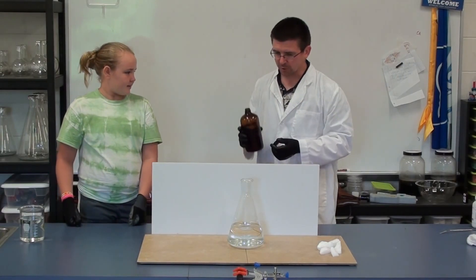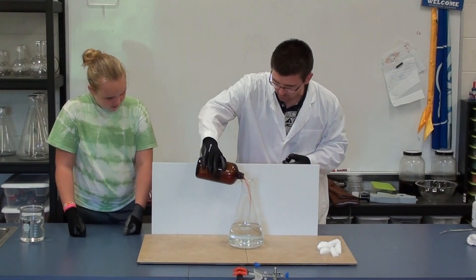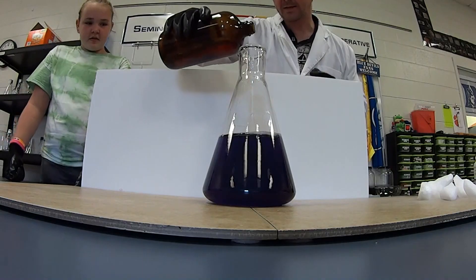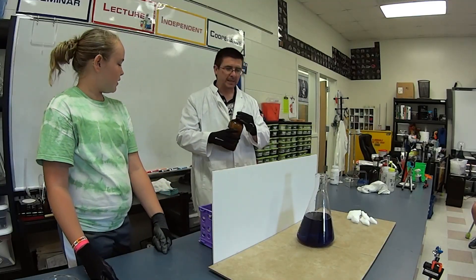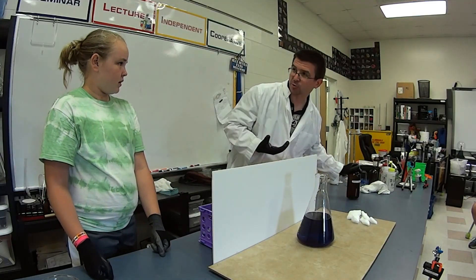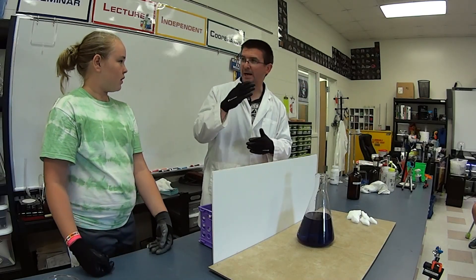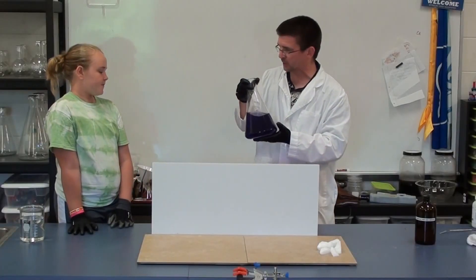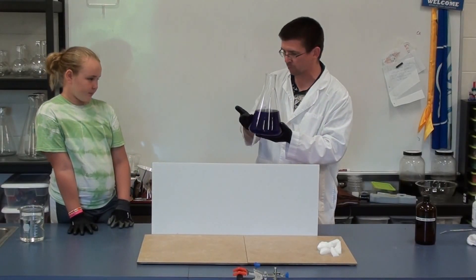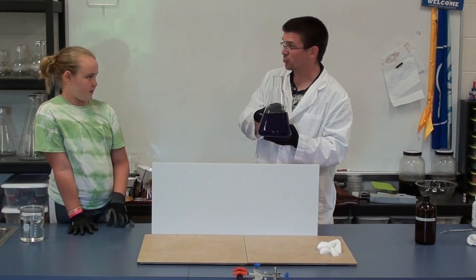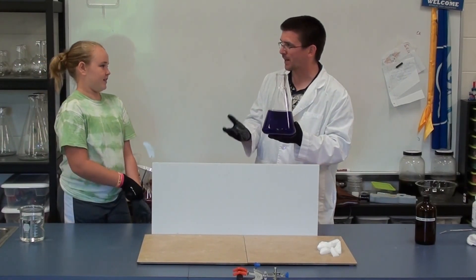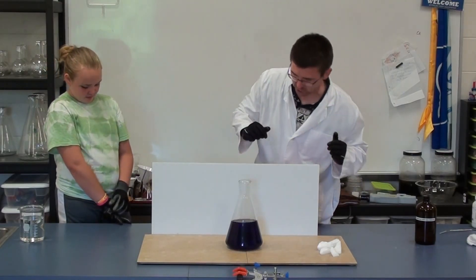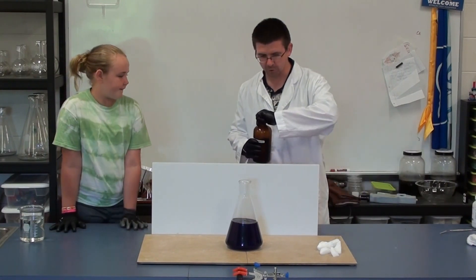I've got some universal indicator here, and I'm going to pour that into this flask that has sodium hydroxide solution in it. Sodium hydroxide is a very strong base with a very high pH. Our universal indicator tells us the pH of a liquid — purple is a base, green is neutral, red is a strong acid, and yellow is a weaker acid. We're going to make a color change reaction using dry ice and universal indicator.